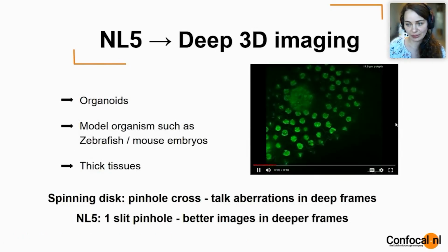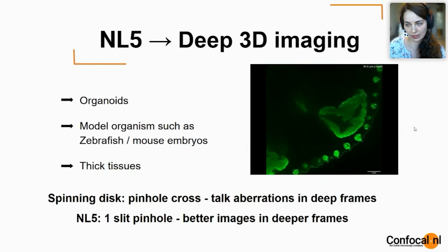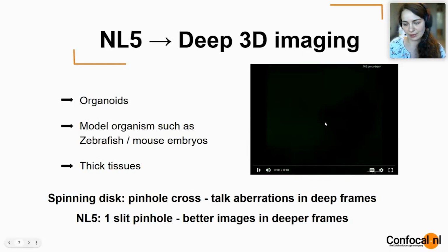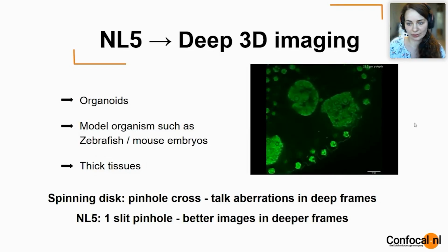For this experiment, we were imaging a Volvox sample, and now we are going deeper and deeper in the sample. And even though we are now more than 90 microns deep in the sample, we got a nice high contrast image with this confocal unit.